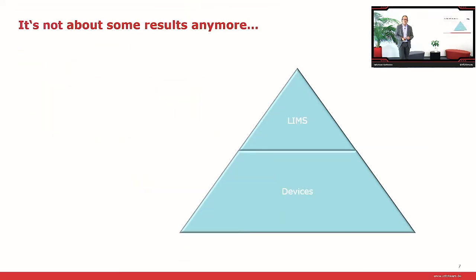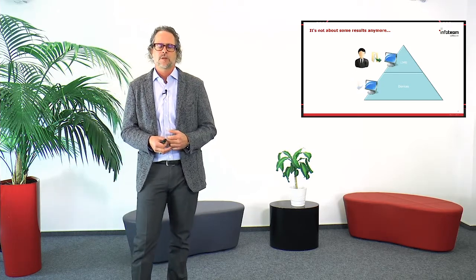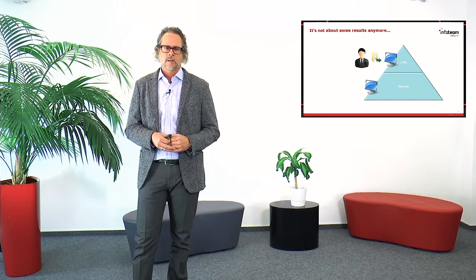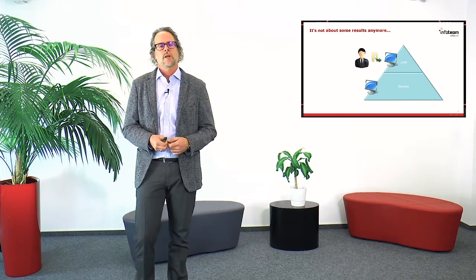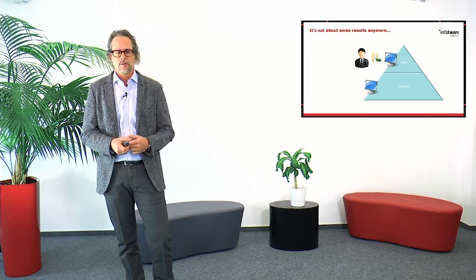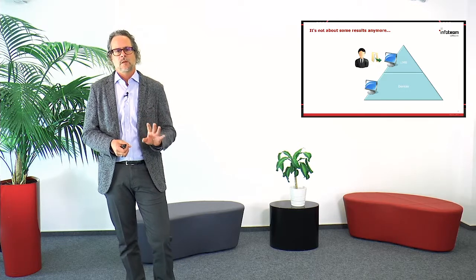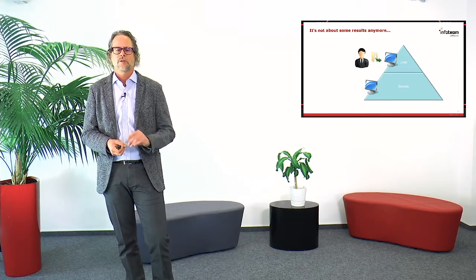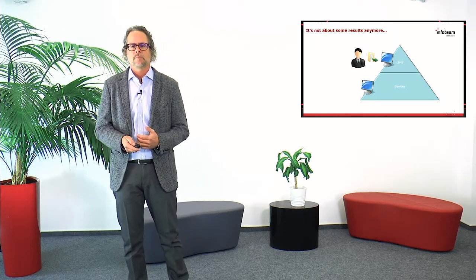So now you might think, okay, today we have some more results and perhaps we have a LIMS and everything should be fine now. Well, actually that's not so much the case, because in most of today's labs, the LIMS is just a data sink where all the data gets carried to on a USB stick by the lab operator. So devices produce results, the lab operator carries them over and enters them into the LIMS system. There was a recent study which stated that the same data set gets put into different systems 40 times over its lifetime. That can't be the case, actually.